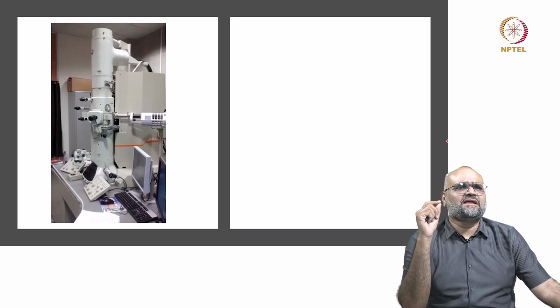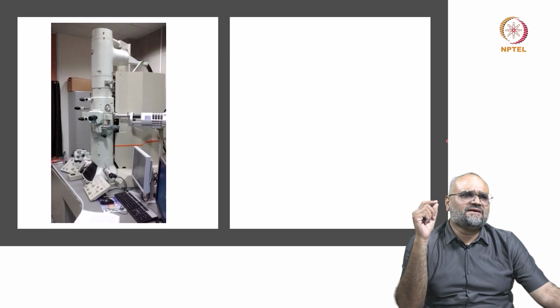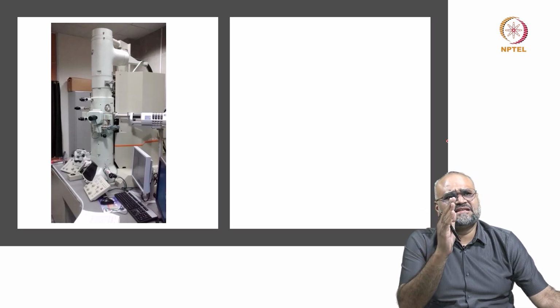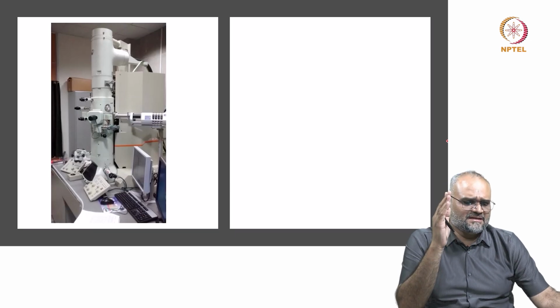In order to obtain high resolution micrographs, the first thing you need to do is orient the crystalline specimen into the zone axis as perfectly as you can.